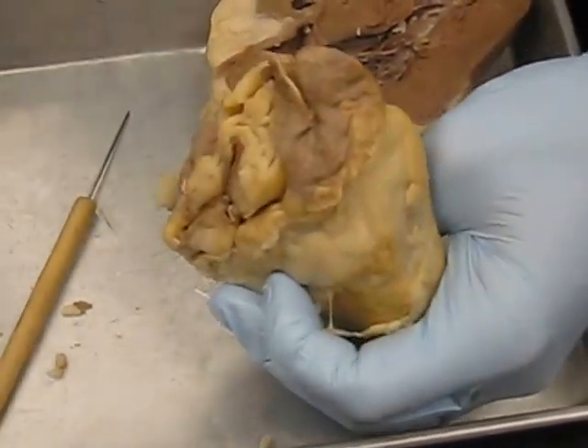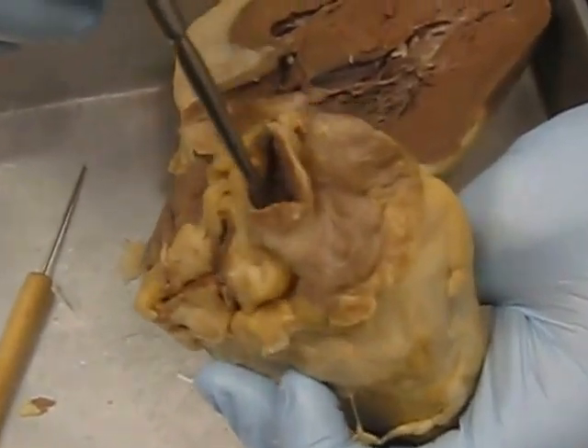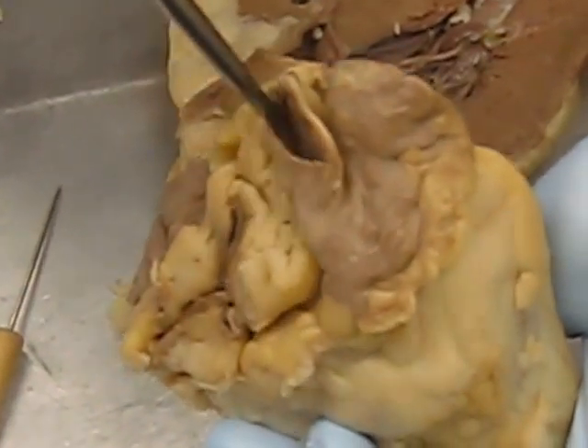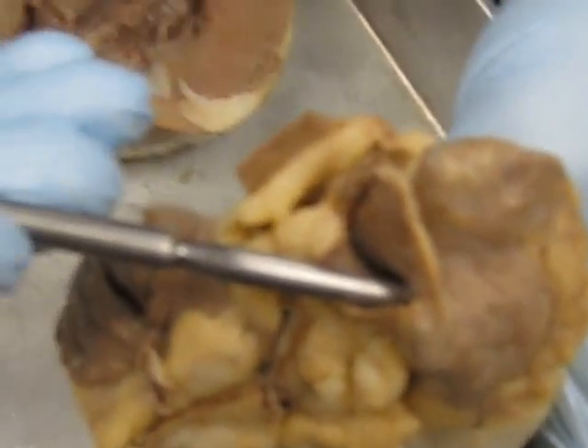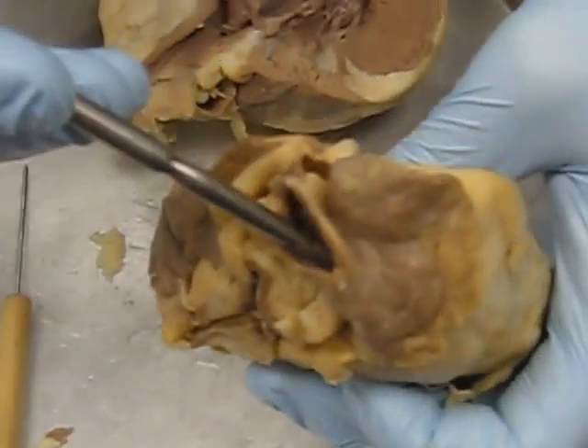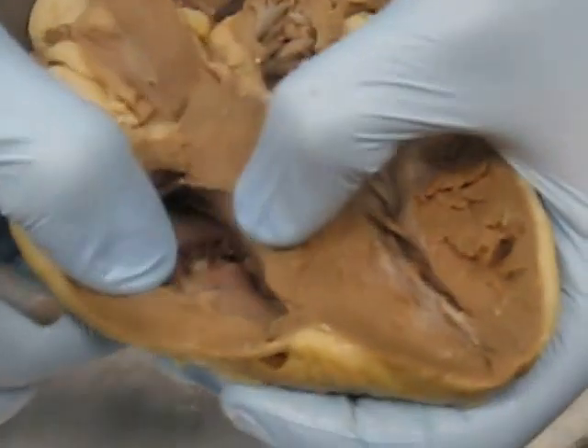If we're going to follow the flow of blood, we're first going to start from the body going into the superior vena cava — this vessel right here — and it's going to drain into the right atrium, which is this chamber right here.